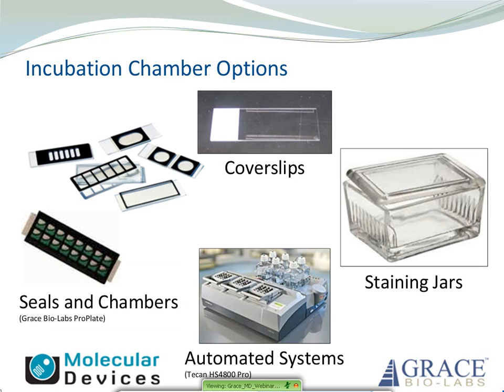There are many available chamber options for users to perform their protein array incubations. You'll probably all recognize the variety of options shown on the slide. They range in volume requirements, cost, and effectiveness. Each has strengths and weaknesses. For example, incubations under a cover slip require very little sample, but are limited to simple diffusion during the incubation, and this can really hinder your results.